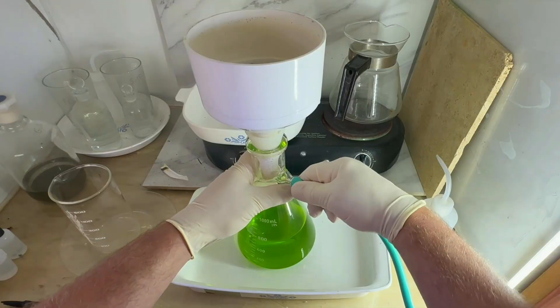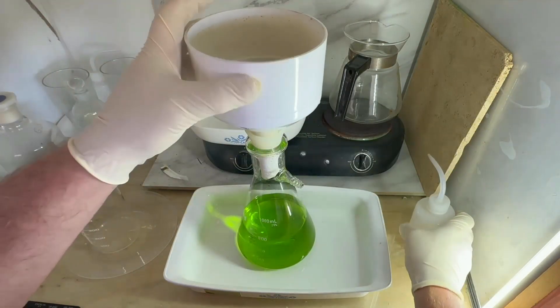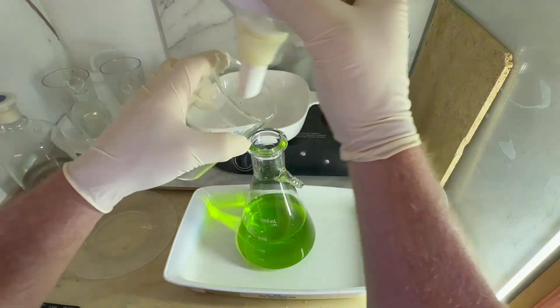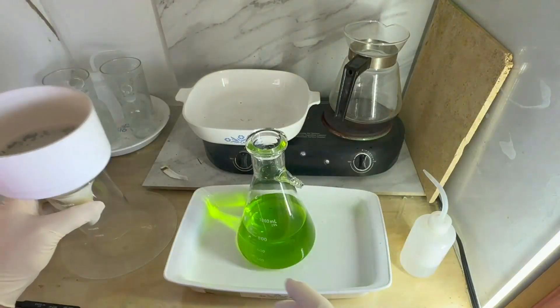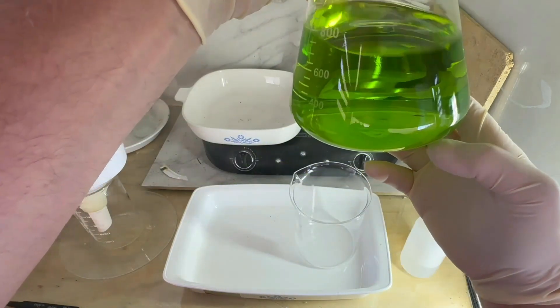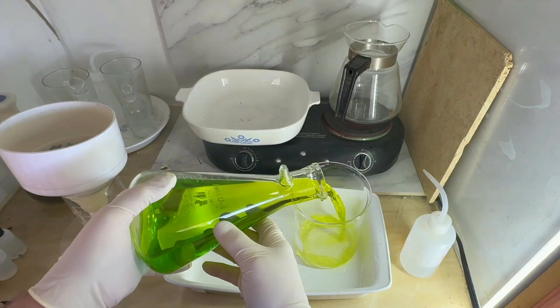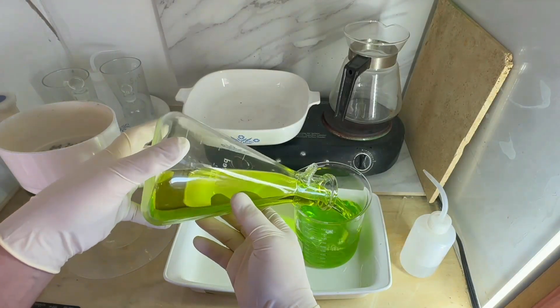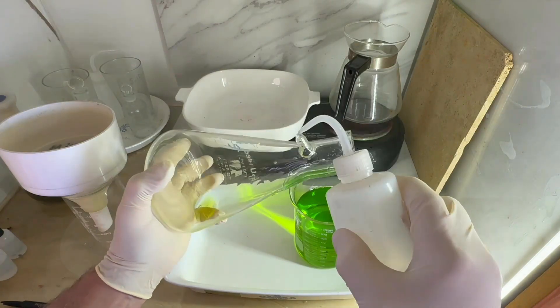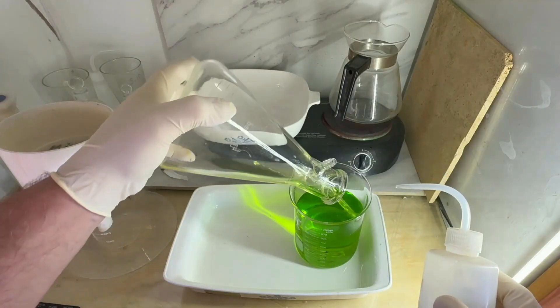Filtration is complete. The filter still has the silver chloride and everything we'd expect, but the important thing is our solution — 90-plus minutes well spent because that solution is crystal clear. We're ready to move on to precipitating and recovering our gold powder from this first recovery step.